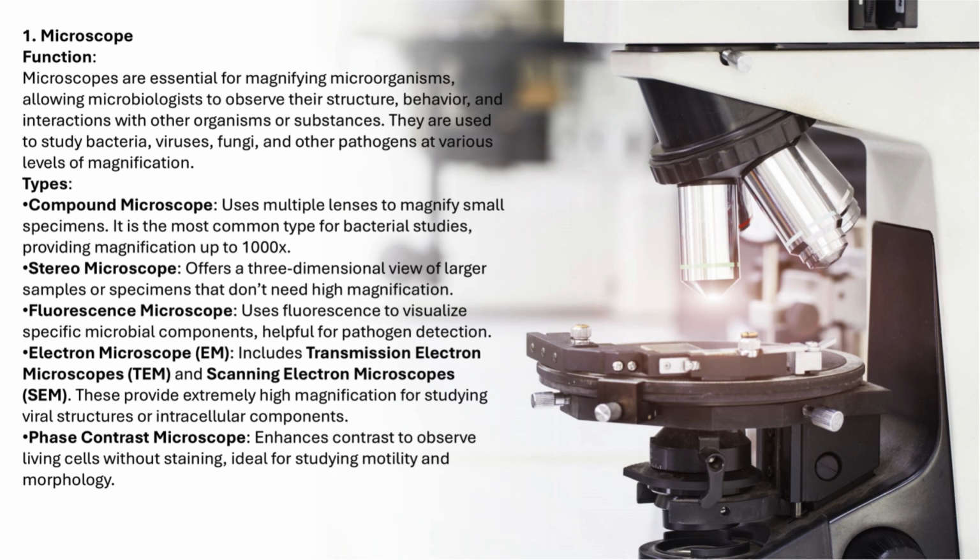Let's start with one of the most essential tools in any microbiology lab, the microscope. Microscopes are absolutely crucial for microbiologists because they allow us to see the invisible. They let us zoom in on bacteria, viruses, fungi, and other pathogens, helping us understand their structure, behavior, and how they interact with the world around them. Without microscopes, studying these tiny organisms would be nearly impossible.